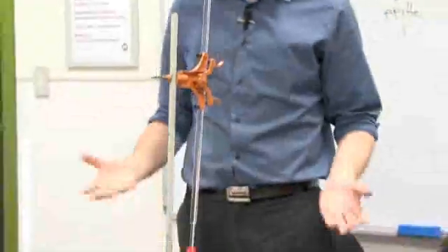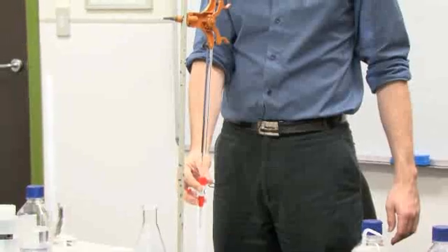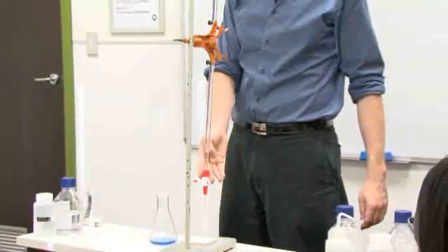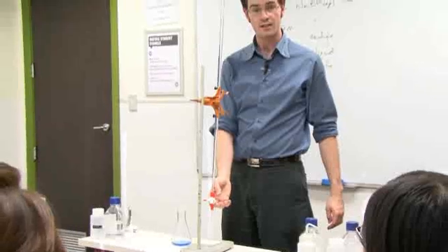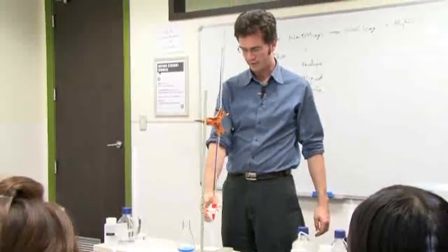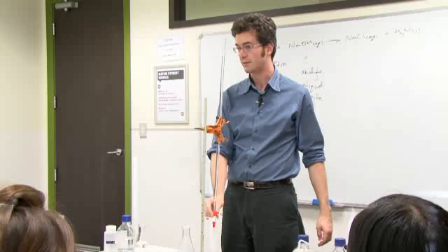How to use the burette. Most people assume that because you're right-handed, you use your right hand for the burette. You don't. The reason is, by the way, this is a safety burette. Notice the plastic. Most burette is made out of glass. So if you're holding it with your right hand and twisting the knob, you can actually apply quite a bit of torsion and snap the glass.